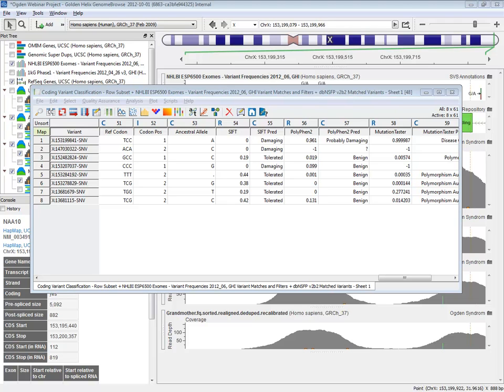Yep, there's a great question here: GATK calls multiple samples at a time potentially, so is there any reason you have this set up as a single sample? The reason is essentially bioinformatic convenience. The variant caller that calls multiple samples together is more computationally expensive, runs on a bigger machine, takes longer, takes more memory, etc. I actually do prefer it as well. If at all possible, put a trio into the consensus genotype caller, so that for every single variant it wouldn't fill in with holes.